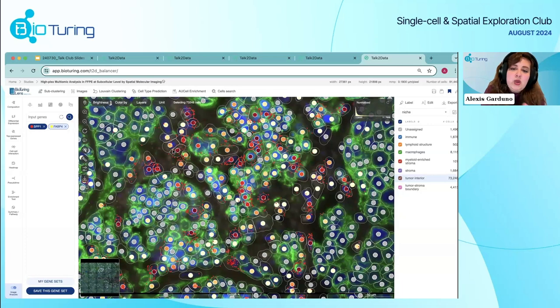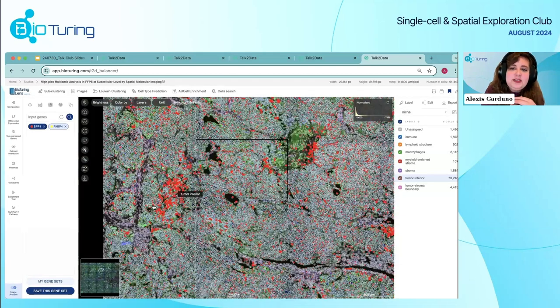When we query a specific gene, we see the actual transcript information of that gene target. Some cells might have a higher enrichment of the SPP1 transcript. Especially in some tumor cells, lesion areas, or primary tumor areas, you see that this SPP1 marker is highly focused and expressed, with numerous transcripts within one cell, for example. So this is a way to interpret this, okay?